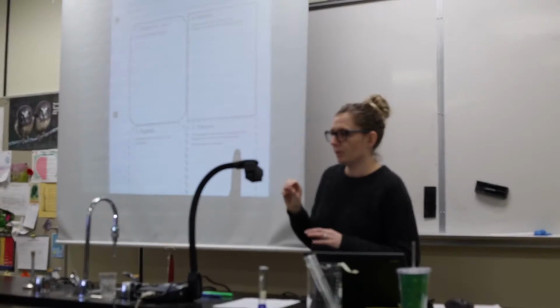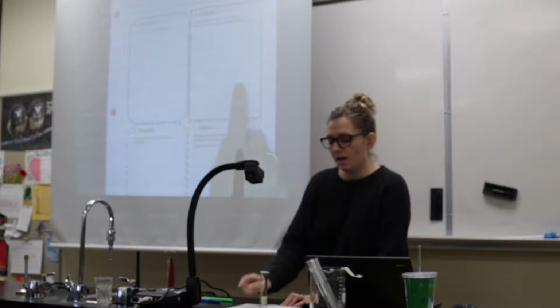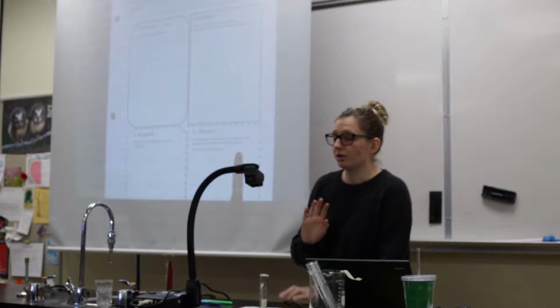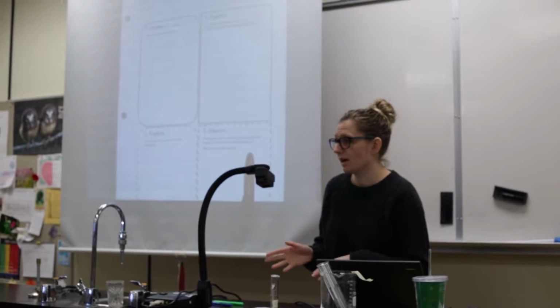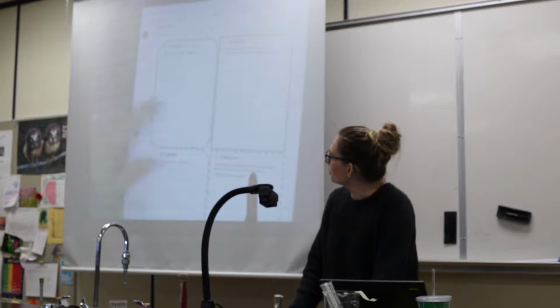Predict, explain, observe, explain today. The first one is they're both with unknown solutions, and we've labeled them A and B. So on your PEOE today, you're going to go through the steps.